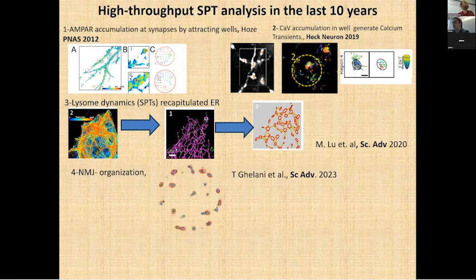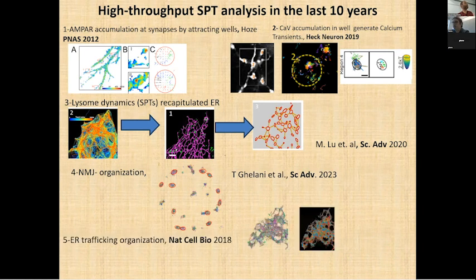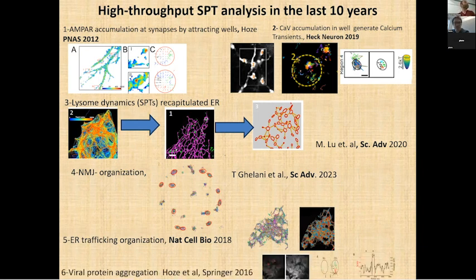In the neuromuscular junction, you can see how well organized these high density structures, these potential wells, are. You can use this, we will see how, from single particle trajectories inside the endoplasmic reticulum, where each color corresponds to one trajectory, but as we will see, if you change the color code, if you start to plot the velocity with a color code where high velocity is red and low velocity is blue, suddenly you start to see the topological organization emerging from the trajectories.